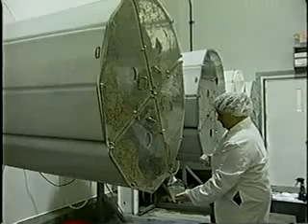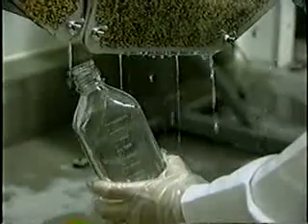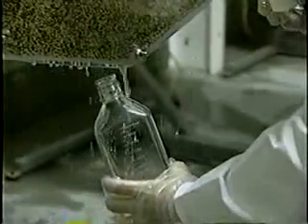Aseptic sample collection means that the procedures are designed to avoid introducing microorganisms from the hands, sample containers, air, or anything except the sample itself. Aseptic procedures are critical to avoid contamination of the sample during sample collection, storage, and transportation. Equipment used to collect samples should be clean and sterile. Sample containers may include pre-sterilized plastic bags, tubes, cups, and flasks.